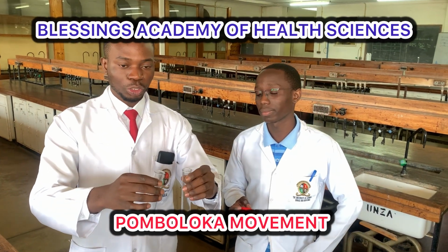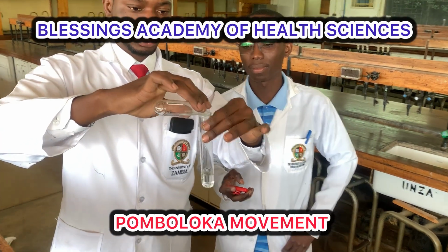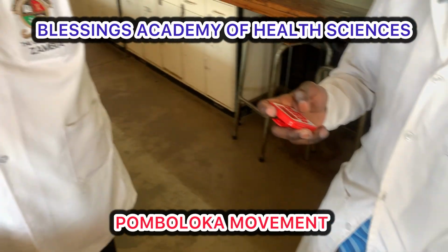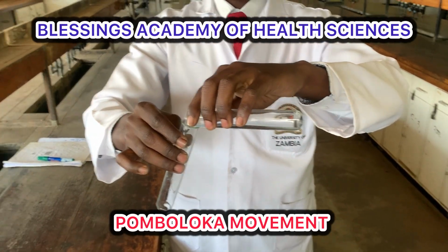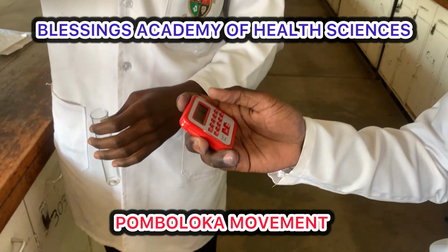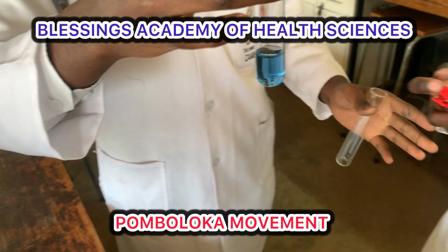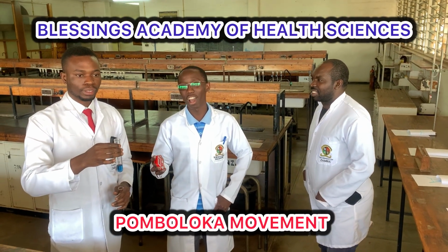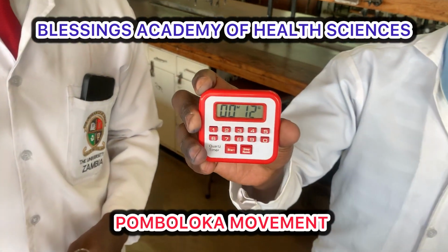Exactly. So I'm going to mix this. Now keep mixing that until we see any color change. Exactly. So there's a color change here. And remember in the introduction, you mentioned something regarding the color change which has happened here. Exactly. So as we know, we have formed a complex between starch and iodine after the reaction at the end. And our time, as you could see, is 12 seconds.